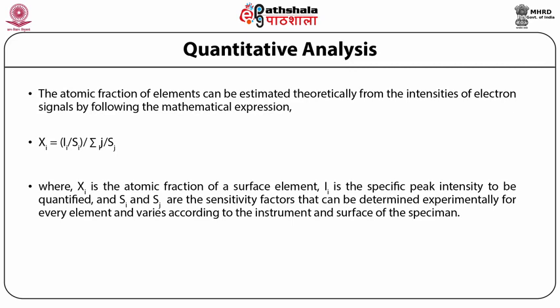Generally, the sensitivity factors are taken from the published handbooks with certain corrections according to the instrument characteristics. As it is not feasible to compile a set of in-house sensitivity factors, the intensities of XPS peaks are evaluated from the peak areas after subtracting the background, and the chemical contamination on the surface of the sample affects the accuracy of equation 1. The quantitative estimation using this equation is based on a few assumptions and approximations. Caution needs to be exercised during calculations to prevent erroneous results.